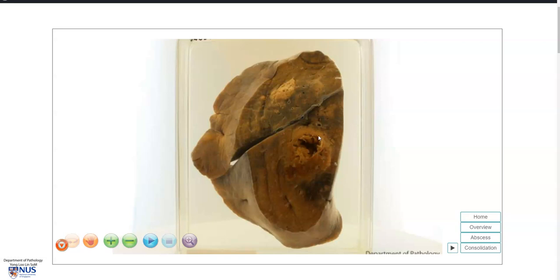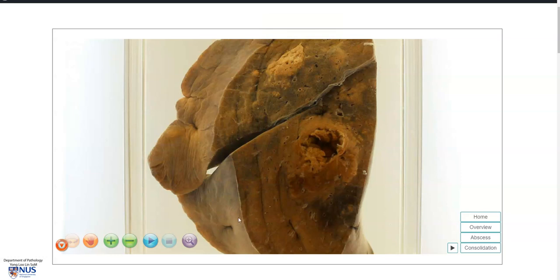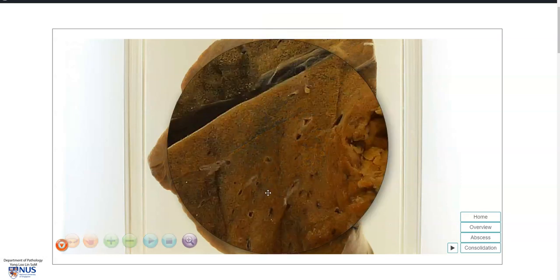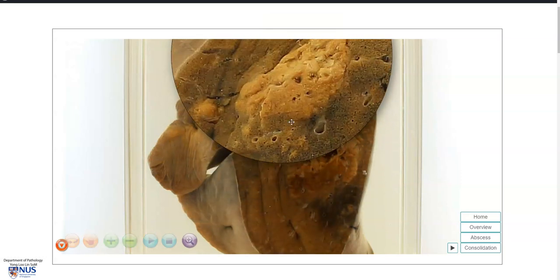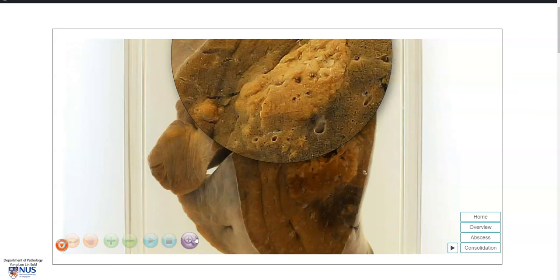The diagnosis here is abscess of the lung and we're looking at a cavity. Before we zoom into the cavity, we can also see some other areas of discoloration, and the lung parenchyma looks more solid rather than spongy. These are areas of consolidation or inflammation in the lung, and this is secondary to infection.